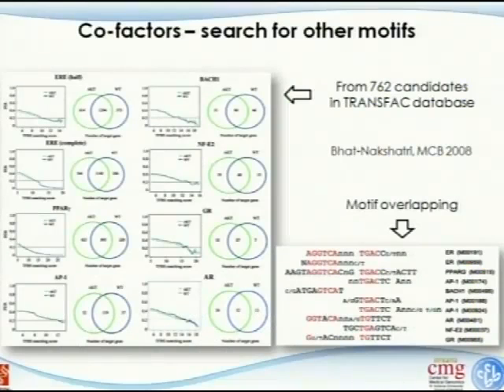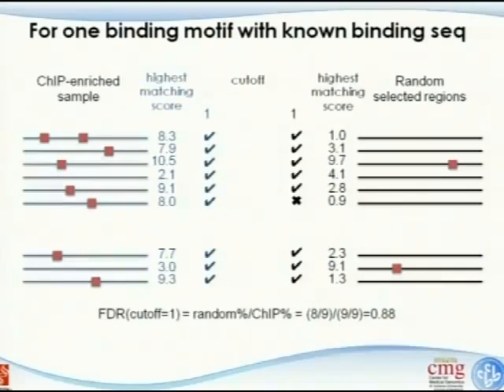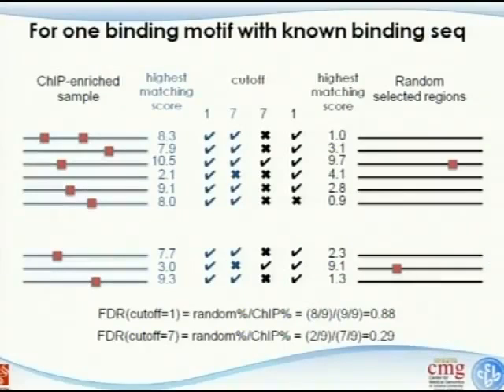There's one more thing that I want to mention here: there are some considerations when you select random regions. The first part is the ChIP-enriched regions, which is kind of straightforward. Whatever ChIP peak calling you identified, I'm fine with it, and you just search your motifs in this region. The second one requires a little bit of consideration, and we did something wrong initially. That's why I noticed.